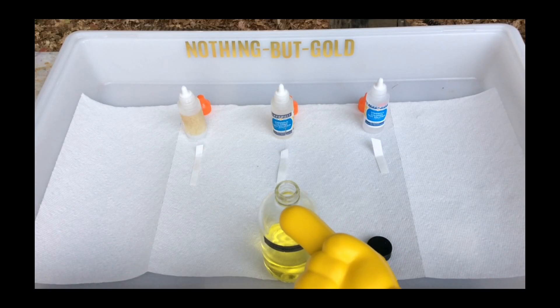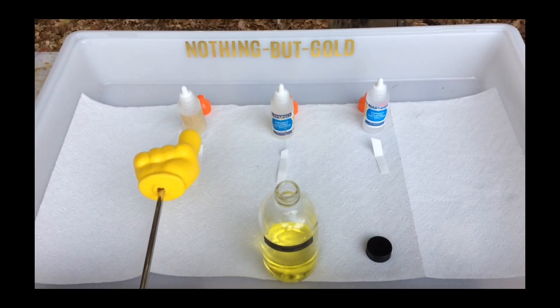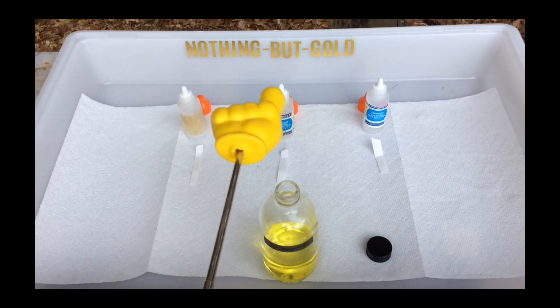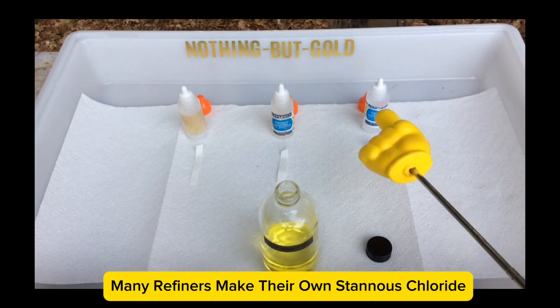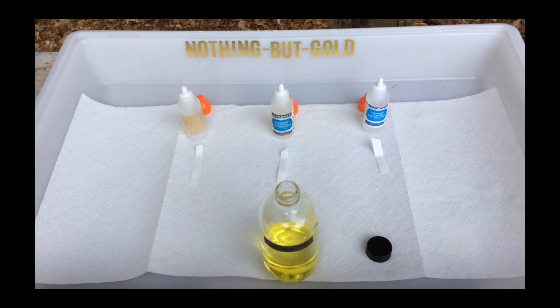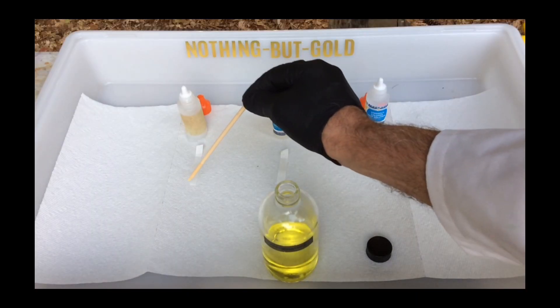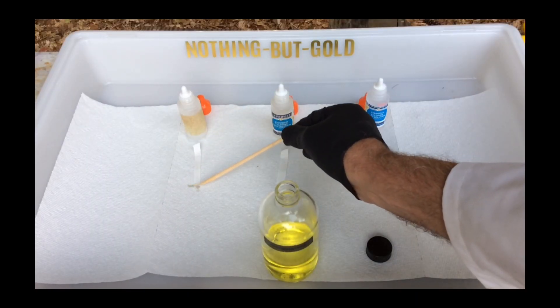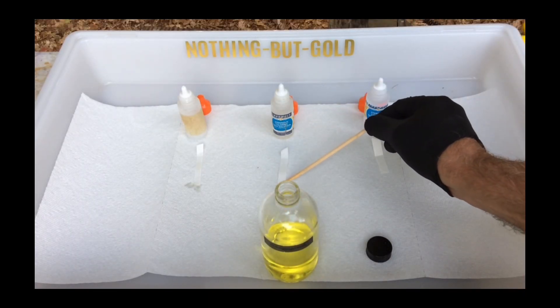The yellow liquid in the bottle in the foreground contains chloro-auric acid. I have three separate bottles of Stannous Chloride of different ages. Stannous Chloride is used to test the presence or absence of dissolved gold. It is critical to have a fresh bottle of Stannous Chloride as you refine gold and other precious metals.